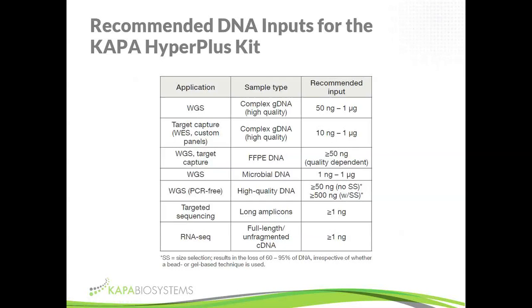A little caveat here, and we'll talk about size selection. When you have to do size selection for your application, you do lose a lot of DNA, and you have to take that into account when you decide how much input DNA you need to use.